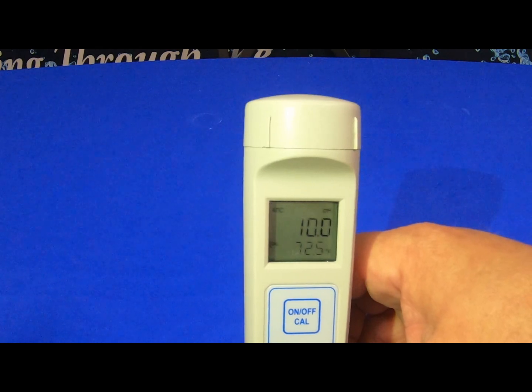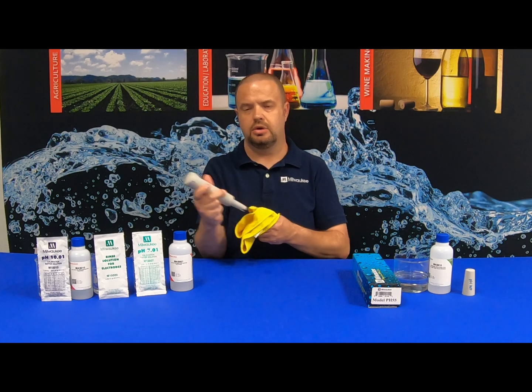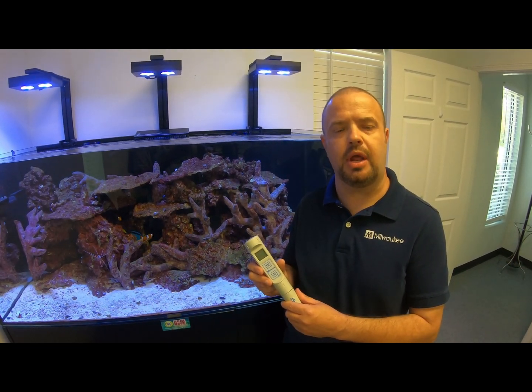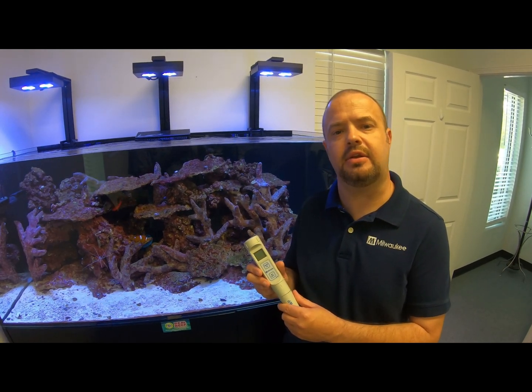Once you get the OK-2, take it out of the calibration solution and wipe it dry. Your unit is ready for use. We're going to check the pH level in our saltwater tank. The pH value should be around 8.2, while the temperature should be around 78 degrees Fahrenheit.